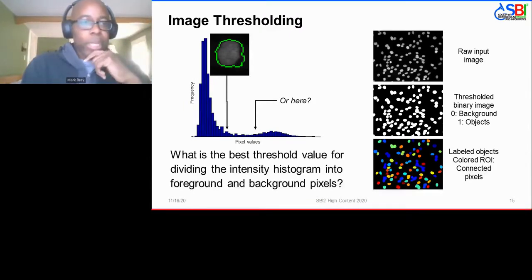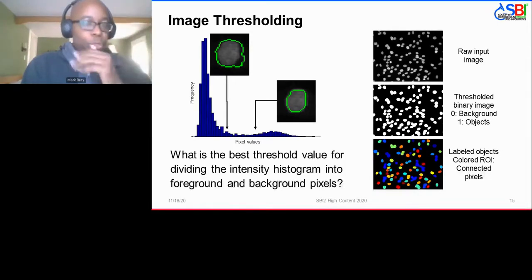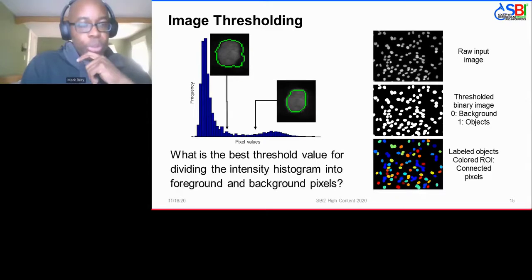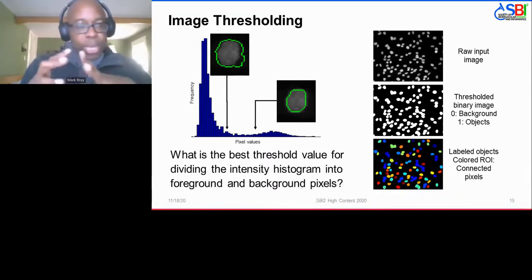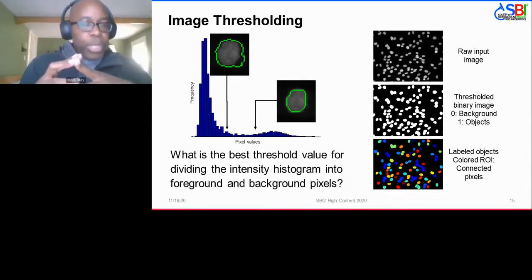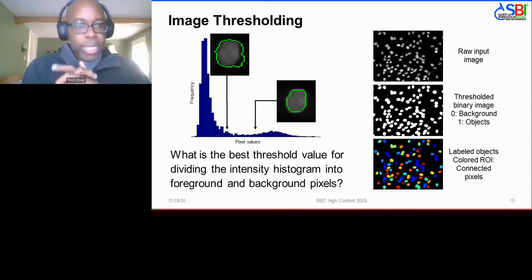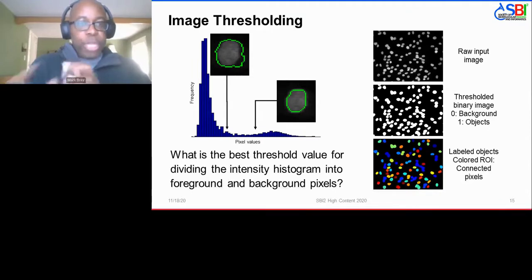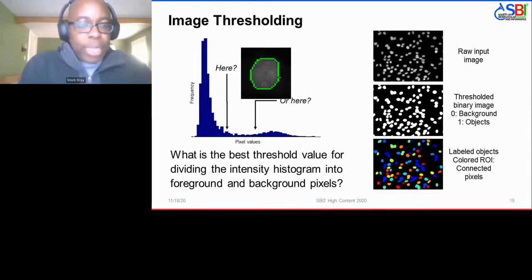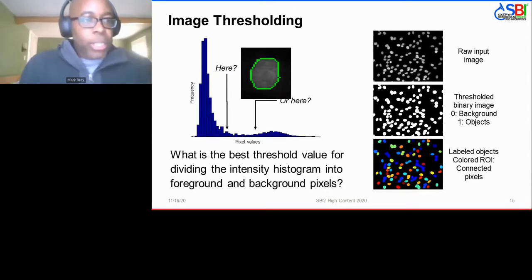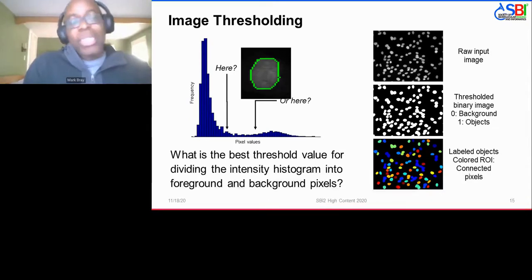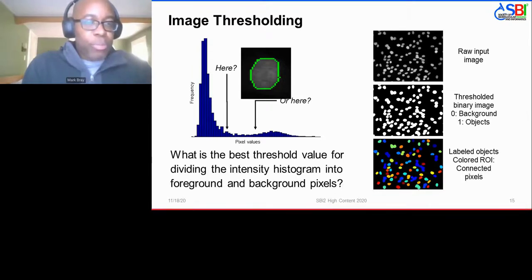It's a classic Goldilocks problem: the optimal choice of threshold is somewhere in the middle, where you capture just the pixels that belong to the nucleus and nothing else. This is a trivial example where the histogram clearly shows the right answer, but in reality things are often much more complicated.